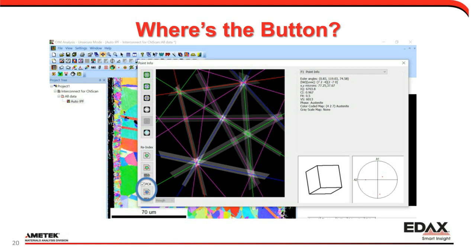Now, look down there in the bottom corner. This is where my button for Chl-Scan is. If you mouse over it, it pops up saying, hey, Chl-Scan. The other thing you're going to see is there's a toggle box there. A toggle box is very important because essentially we have 2 different methods for doing Chl-Scan. One is definitely more user-friendly, and the other one I'm going to touch on a little bit at the end, but not too in-depth. And what we really want here is for that box to be checked.